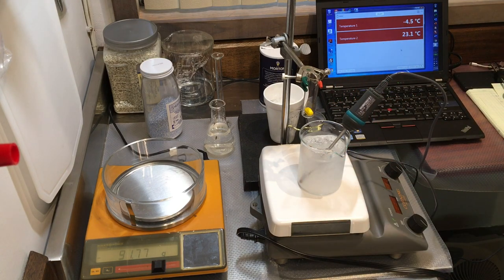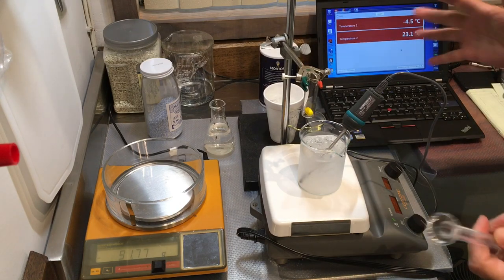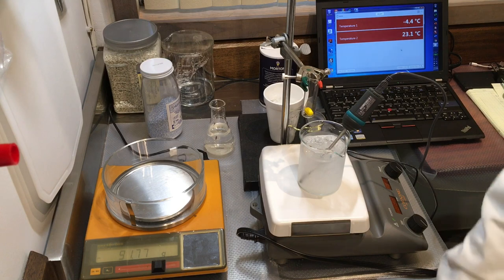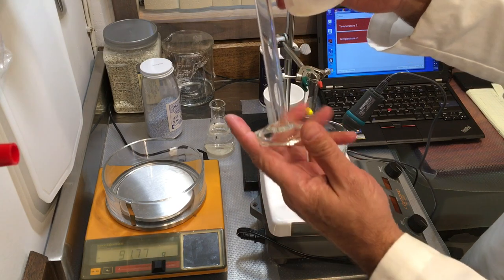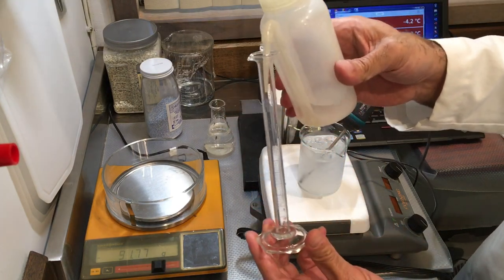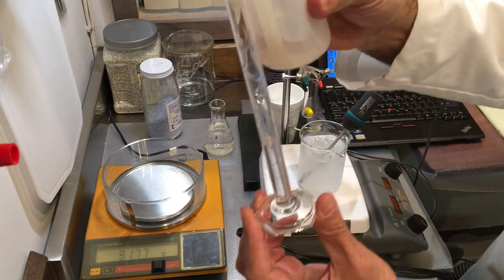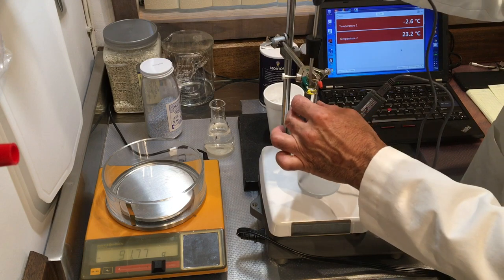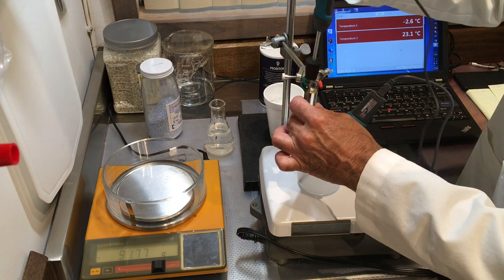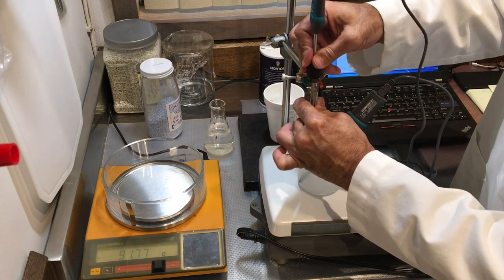For my first experiment, I'm going to freeze some pure water so you can see the freezing point of the solvent. We expect this to be around zero degrees Celsius. I'm going to measure out 8 milliliters of solution in this graduated cylinder, and then put my temperature probe — connected to the computer — inside.